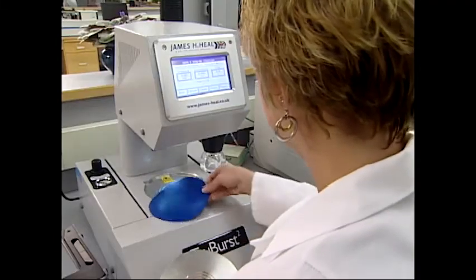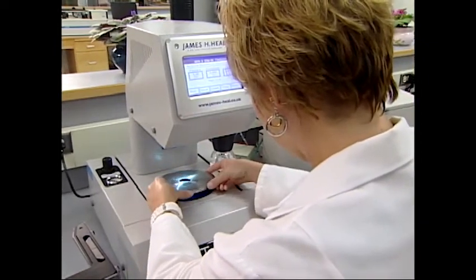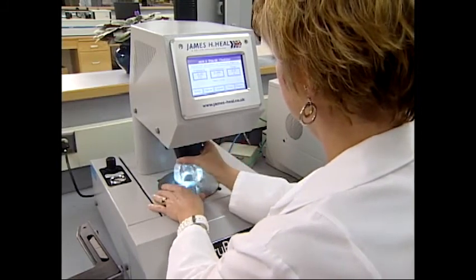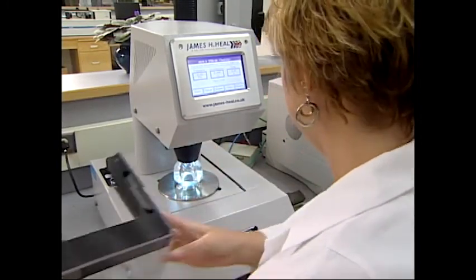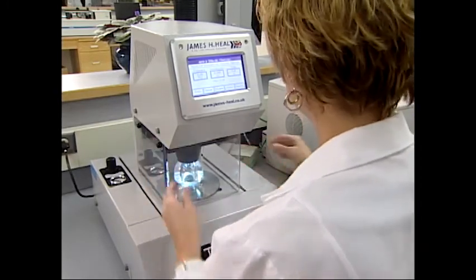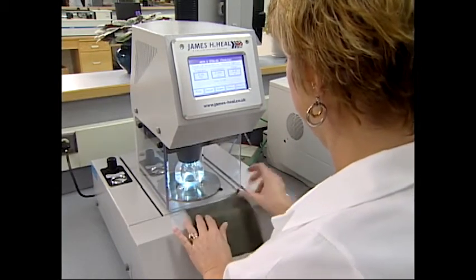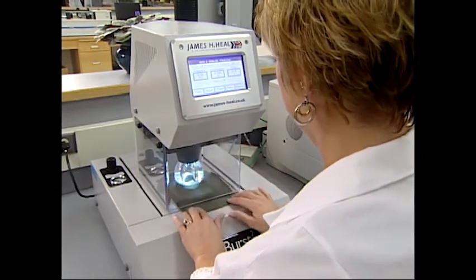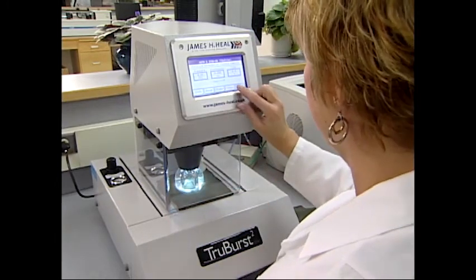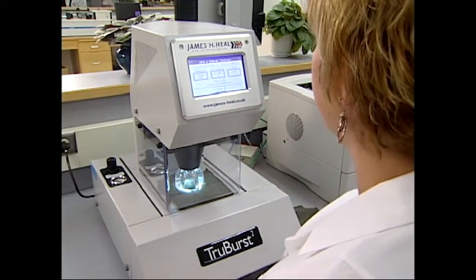The diaphragm is a molded synthetic or natural rubber material that's clamped between the lower clamping plate and the upper clamping ring. At rest, the diaphragm is at a nominal level with the plane of the clamping surface. The diaphragm should be inspected frequently for permanent distortion or apparent loss of material. Due to the elastic nature of the diaphragm, routine calibration of the machine is required. If the system proves to be out of calibration, first the diaphragm and its mounting should be checked, and then the gauges should be checked and adjusted if needed.